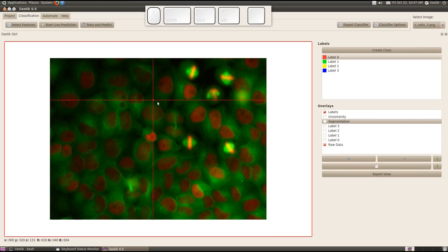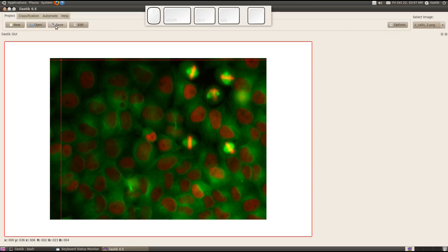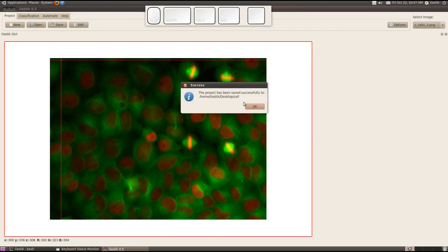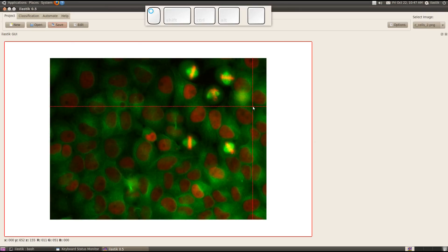Now I could continue giving more labels to correct for these errors. But for now, let me save this project so I can continue tomorrow. I save it to my desktop, giving the name 'cells'. Now all the images, predictions, and labels are saved, so I can easily continue working on those files tomorrow. Thanks for listening — that's it for now and enjoy.